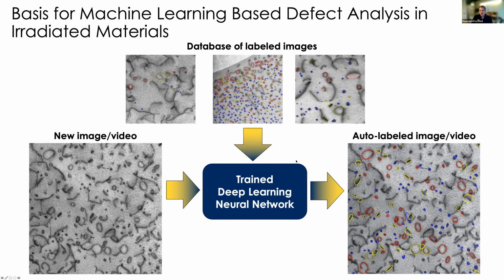All right, so the main requirement for doing this type of technique is a little bit of knowing how to do Python, and then having a sufficient database in order to do the training. And so we are finding that you can do this with as few as just a couple tens, if not hundreds of images, but your performance, or what we call learning rate, really increases when you get to about 1,000 or more features of each individual feature that you're interested in. The other thing too here, this is faster RCNN results. You can actually detect multiple types of defects, which is why we have the different color coding here.